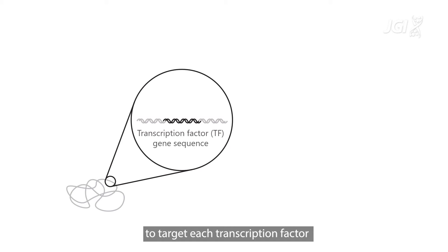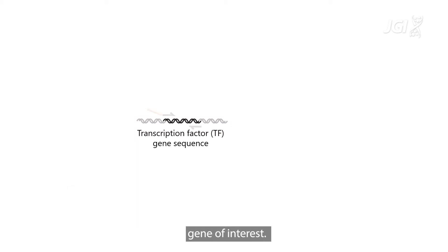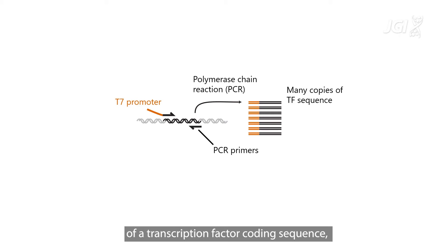We designed PCR primers to target each transcription factor gene of interest. The PCR produces many copies of the transcription factor coding sequence, which we then add to an in vitro protein expression mix.